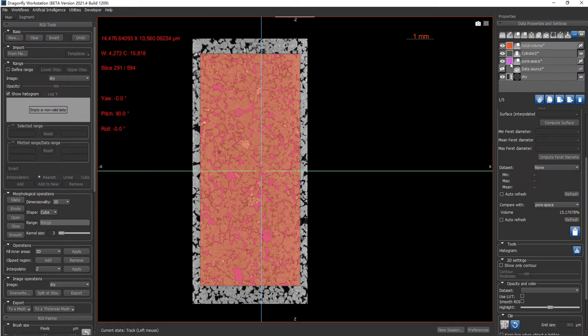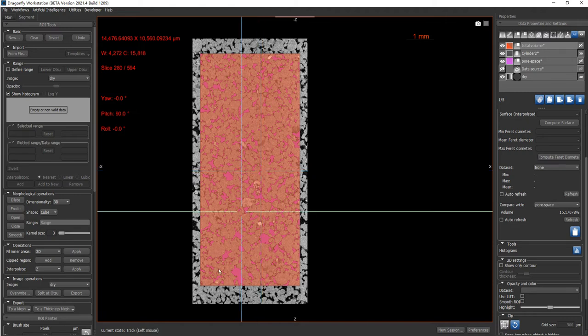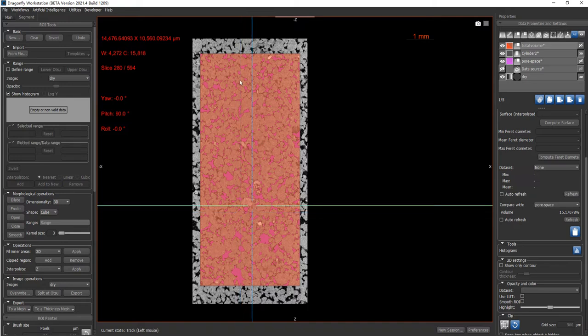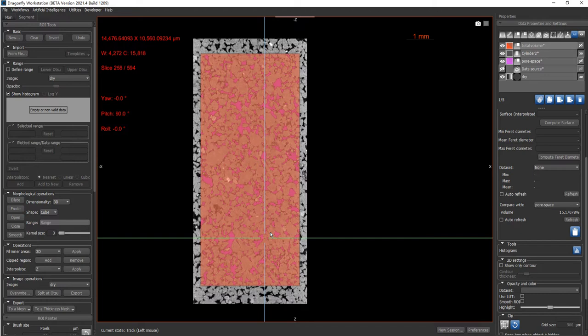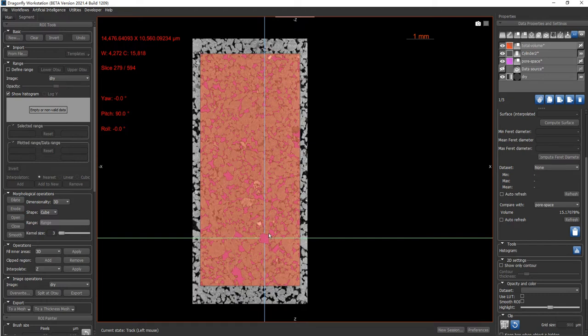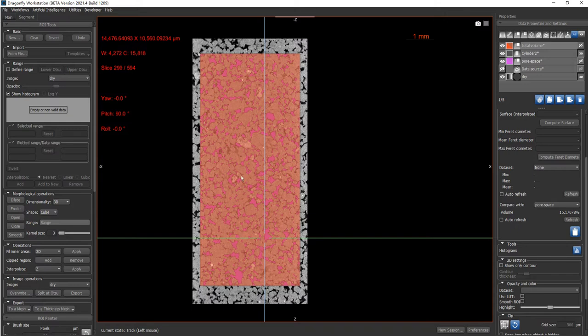Now we are going to get the dispersion of the volume fraction, because the total volume fraction doesn't tell you how the pore space is distributed. Is it the same volume fraction everywhere, or is it somewhere we have big pores, where the pore space is more concentrated in some locations? So the dispersion will tell us how uniform the pore space is distributed.